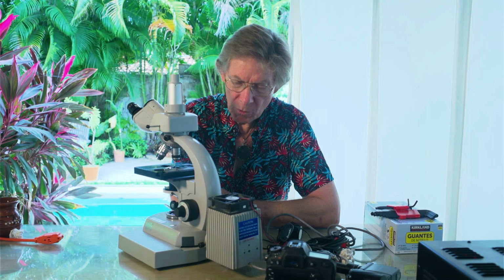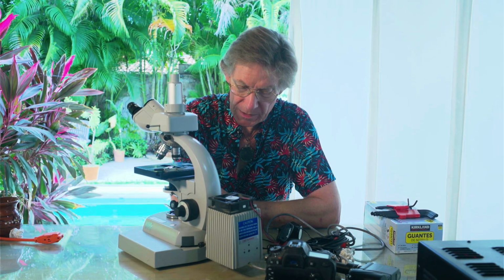One of the most important words in microscopy is resolution. And what that term means is the detail that we can see with the microscope. We want to have extremely detailed pictures. And those pictures then are transmitted to the eyes and to the camera so that we can evaluate what we're seeing. And that evaluation leads us to the conclusions that we have about the person's health, and we can make recommendations on what they need to do to improve their health.